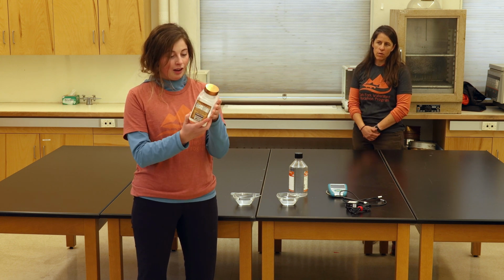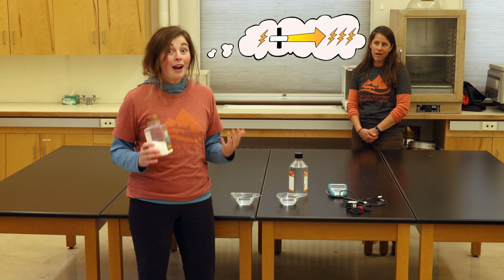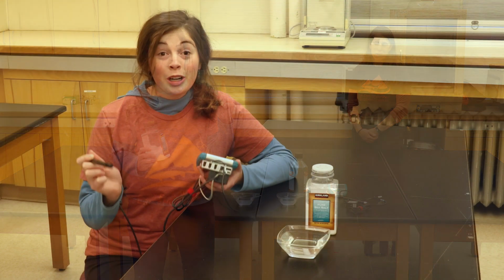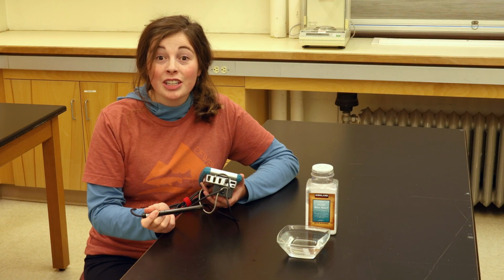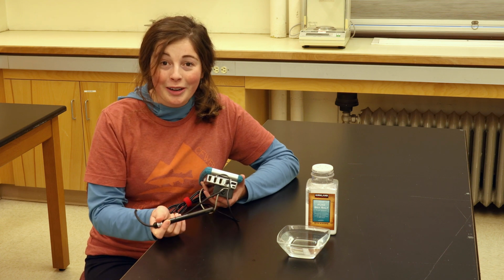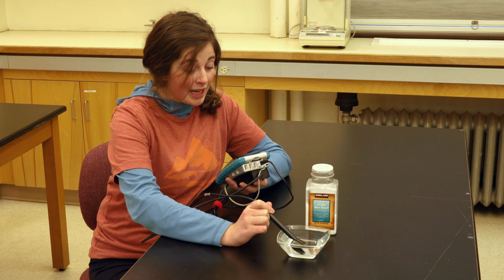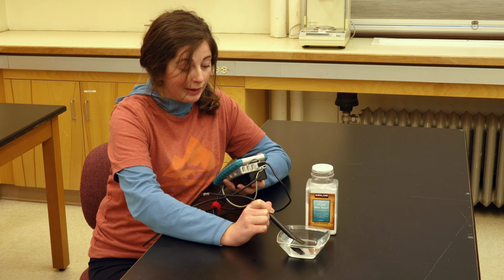So Caitlin, what do you think is going to happen to conductivity when we add salt to tap water? That's a great question, Dalit. I think, given everything that we've learned, there's going to be more ions in the solution, so I think conductivity is going to go up. We're actually going to see if I'm right and see if table salt actually does increase conductivity when we put it into tap water. I'm going to measure the tap water right now, and it's at a low conductivity like we saw before, around 320 right now.